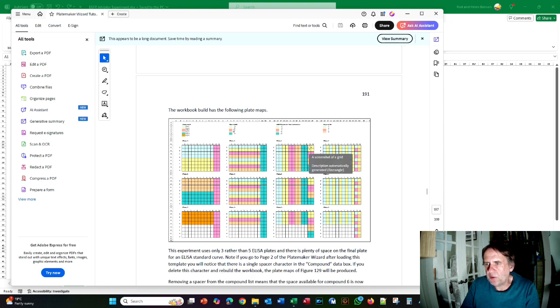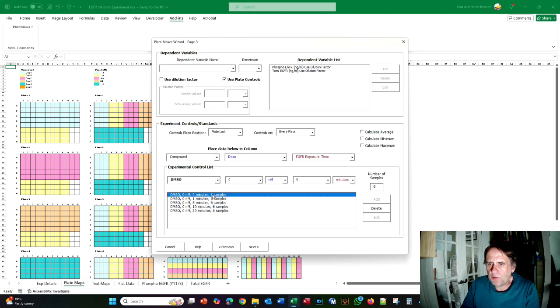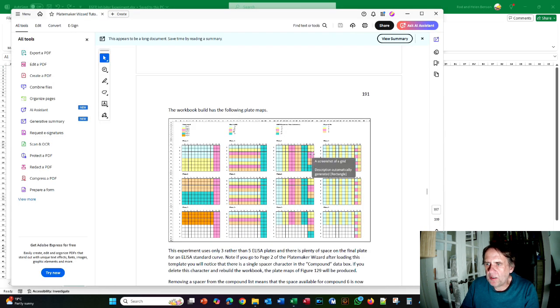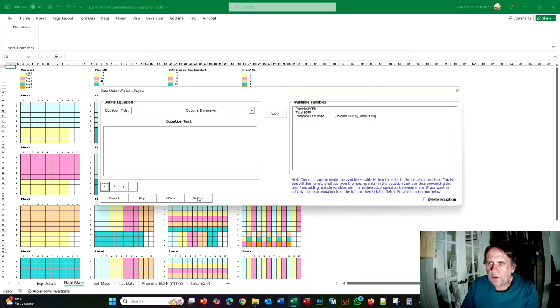So let's do that. So first of all, that means that each sample only has 4 rather than 6. So obviously the control area is a lot less, so we need to decrease the controls. So let's do that. So this is now going to go from 6 to 4. So we go 4, edit, 4, edit, 4, edit. So we're just reducing all these from 6 to 4, which we have now done. And also you'll notice that there can only be 4 little squares rather than 5, so we have to choose to delete one. So let's delete the 30 minutes. We can leave that alone.